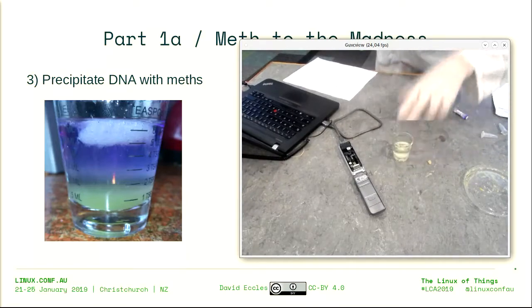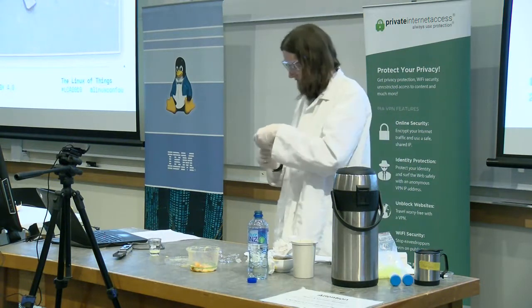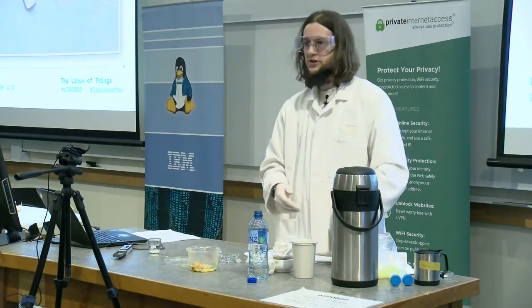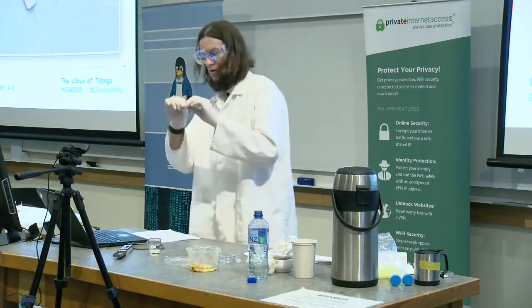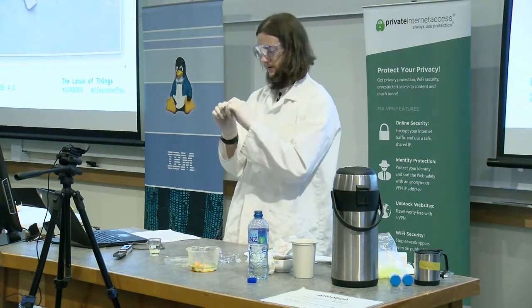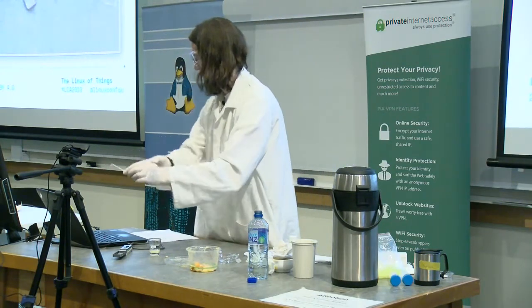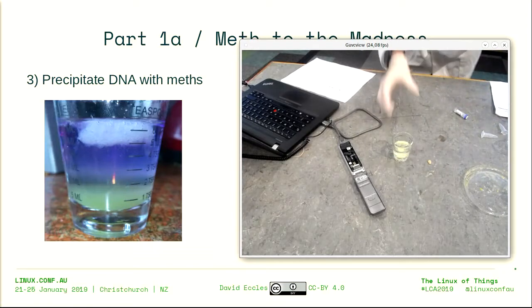Okay, this is what's known affectionately in the DNA sequencing world as a DNA jellyfish. So, I'm going to do a bit of fishing. I've got here a toothpick. So I'm going to bend this toothpick into a hook and see if I can catch me a jellyfish hook. Yes, that's a hook. Okay.